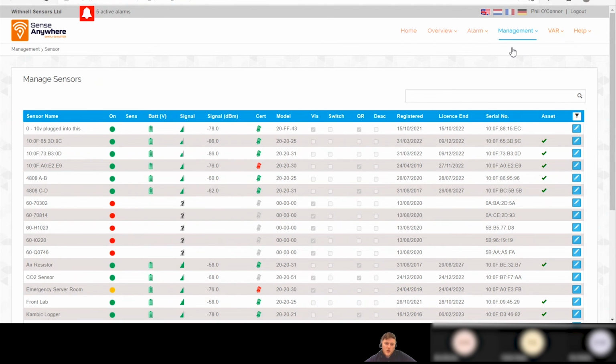Unfortunately, it's a rule from SenseAnywhere. We have to do it. Yeah. I think we are the only kind of UK calibration lab for SenseAnywhere. Whether it's a quality concern or whether it's just I've always been taught that it has to be us. No, that's fine, because we have another systems that we have, and I understand that.